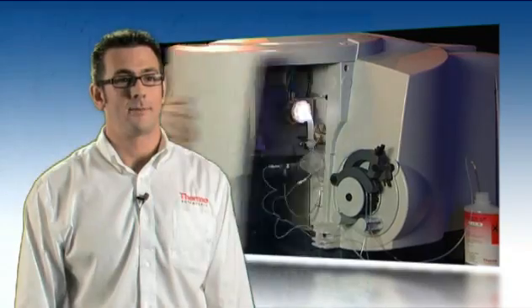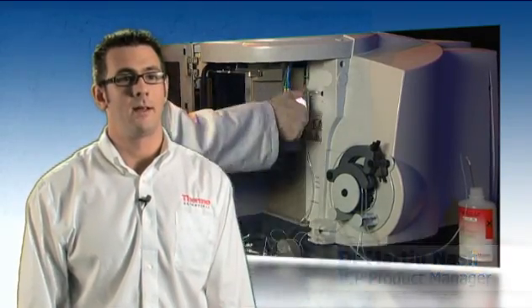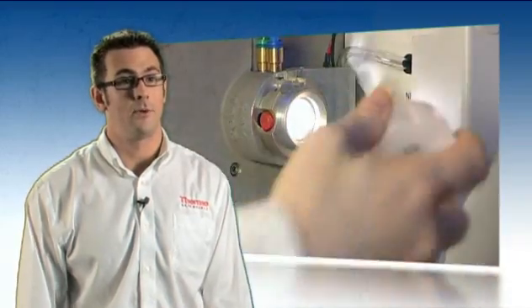The iCAP 6000 series is small on its footprint but big on its analytical performance. The instrument has been designed to deliver exceptional performance and productivity, and there are also versatile model configurations that enable virtually all trace element applications to be performed.